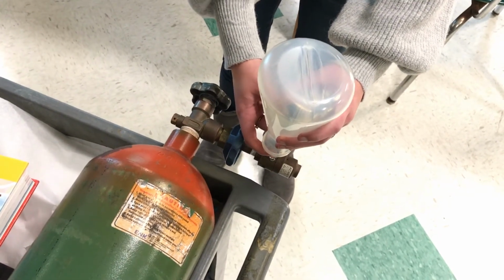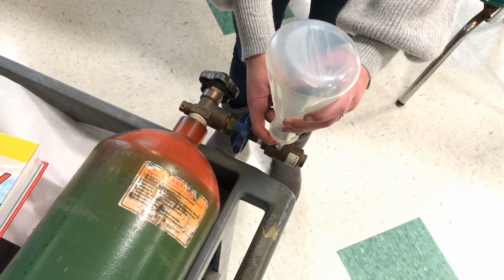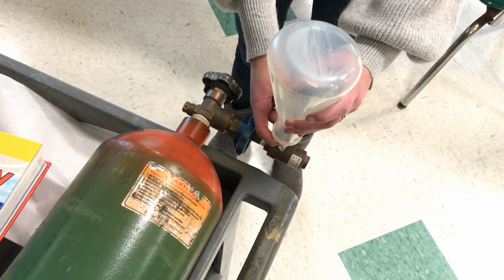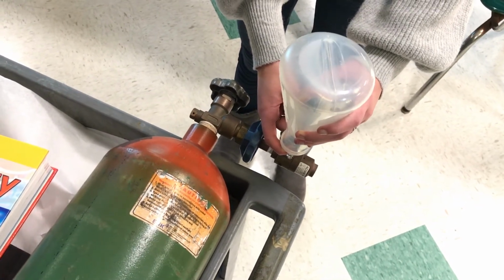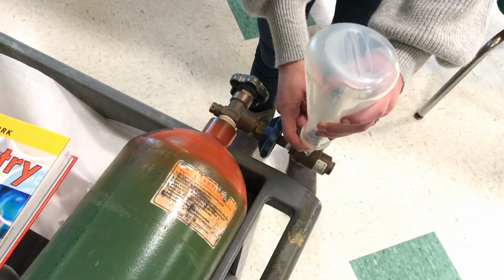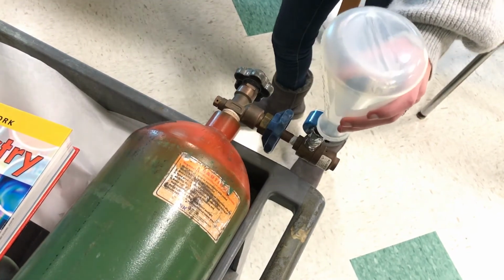So it's filling. Be aggressive. Come on. Good. And that is student E's gas. Come on, do some more. Good, stop. Now leave it. Where is your top? Someone grab it.